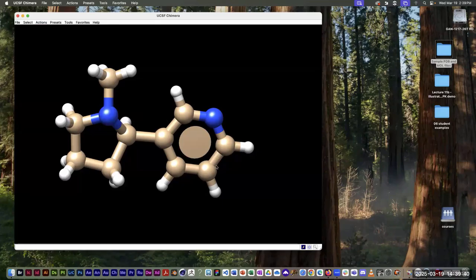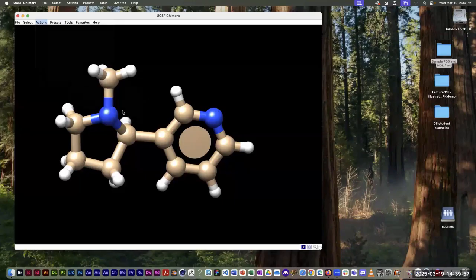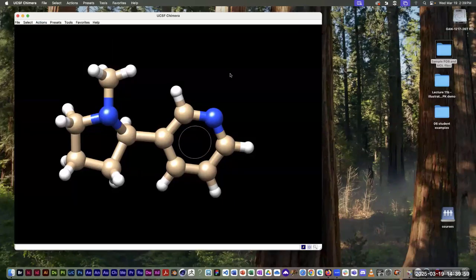This is not really benzene because it's got a nitrogen in there, but it's mostly benzene, and it does have these double bonds cycling through. So the circle is one way of representing that. I could also go to atoms and bonds, rings, and say aromatic circle, which just adds this thin little line. So this is one way that I can tell that this is really a benzene ring with a bunch of double bonds that are cycling around between these 6 atoms here.